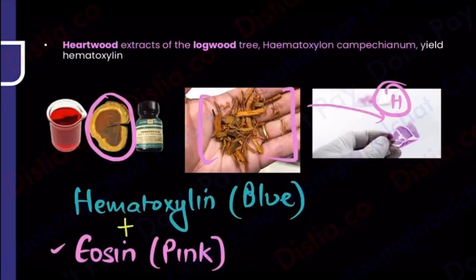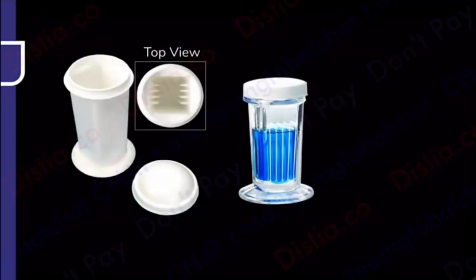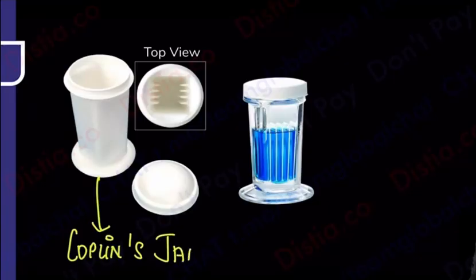How will you do it? By immersing it in what? Have a look at this. What is this known as? What is this container known as? Favorite question. This is known as the Coplin jar. So can you see there's a blue color solution? In this you must have put hematoxylin. You will dip your slide into it.